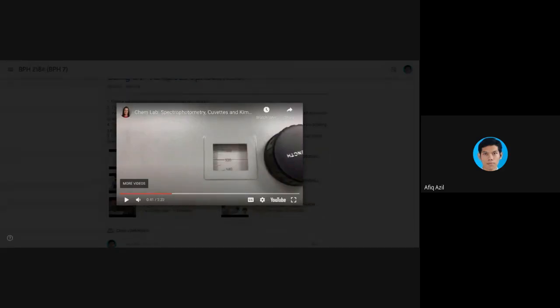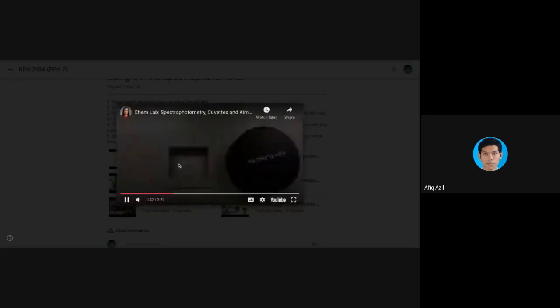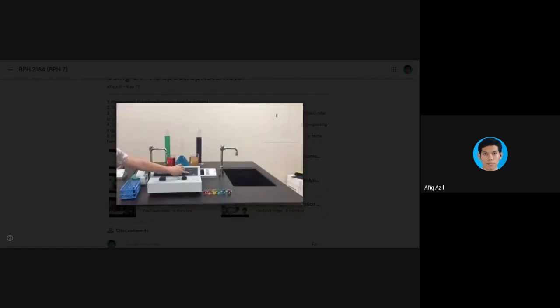The other UV-based instrument in our lab, you can straight away input the number. Let's say you want to change to 700, you can straight away put 700. No need to twist the knob or press a button. You can straight away input the wavelength that you want. Lastly, this is the calibration button, which is used when blanking the machines to ensure the accuracy of the measurement.